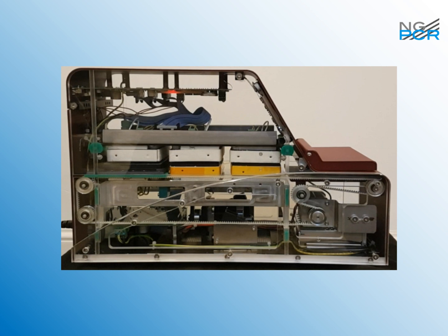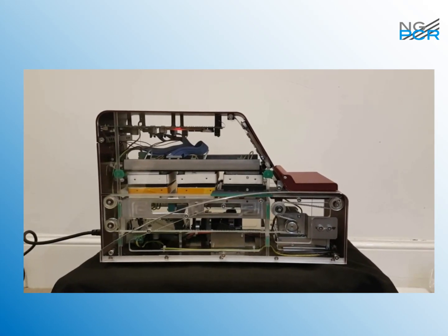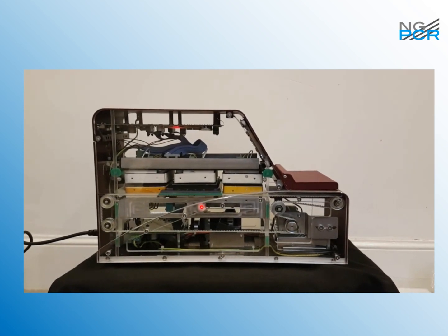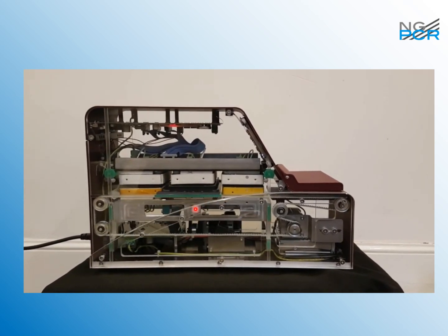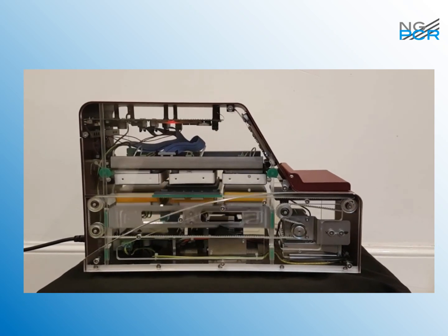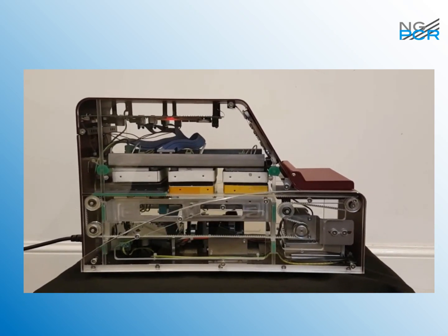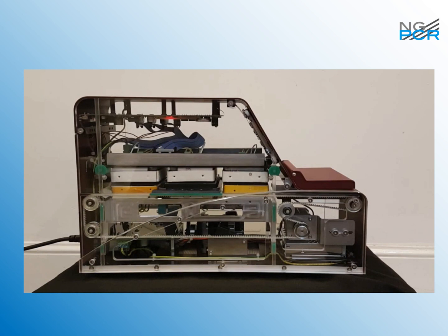I would like to show you a little short movie which shows 3 cycles of the whole process. As you can see, now it's here, it's an extension zone, it's in the denaturing zone. It's in the annealing zone, extension zone, denaturing zone. And this is really how fast it goes. I'll let it run until it's finished. And it stops in the extension zone here. It's obvious we stopped the movie, but it will continue 30 cycles, 35 cycles, 25 cycles, whatever you programmed.